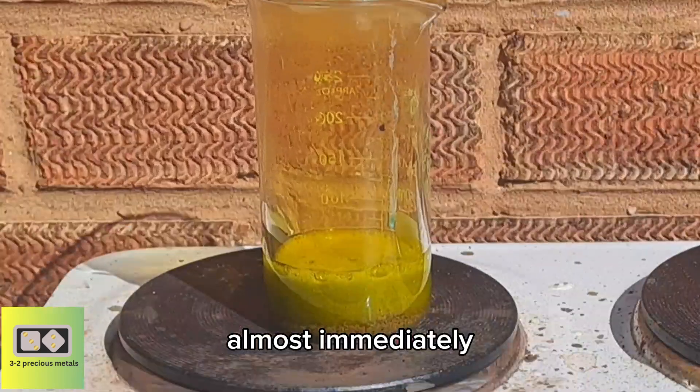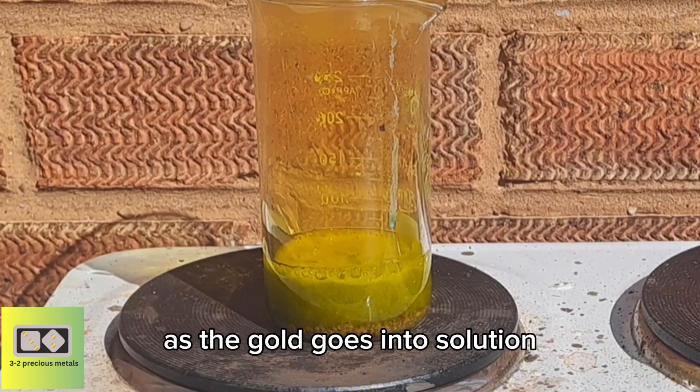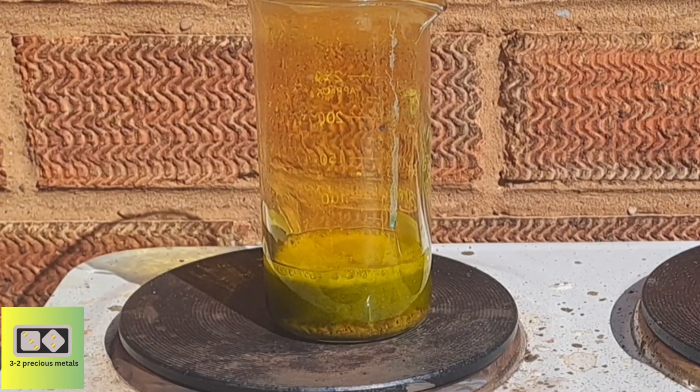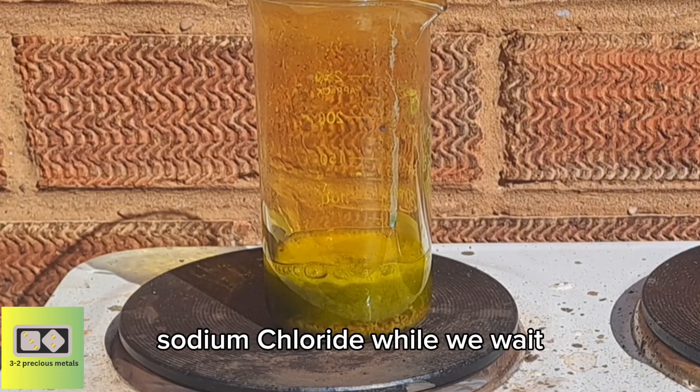Almost immediately getting a very vigorous reaction with the aqua regia as the gold goes into solution. I'll leave it to do its thing and I'll get the silver precipitated with some sodium chloride while we wait.